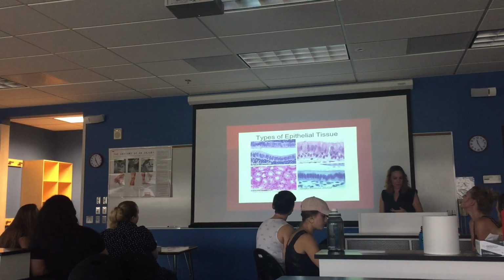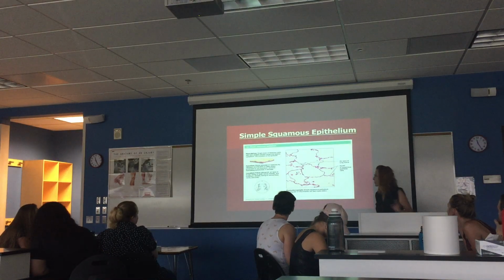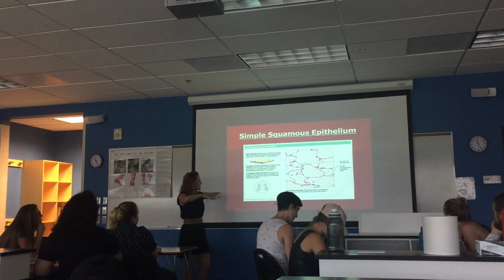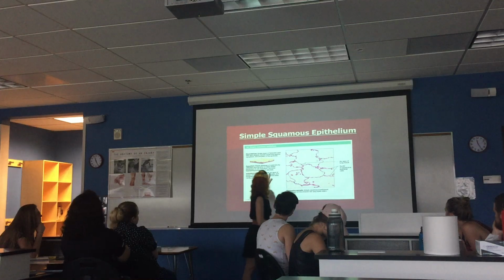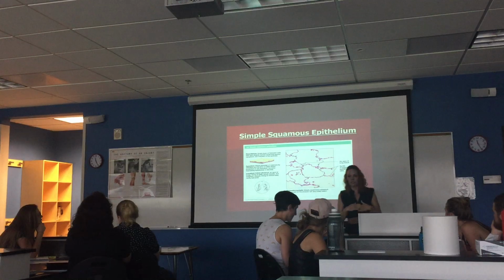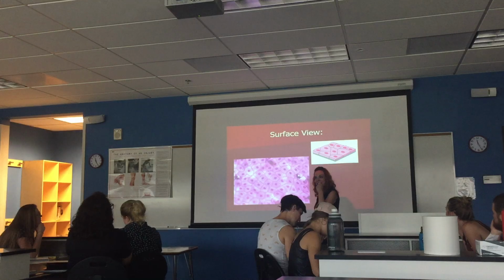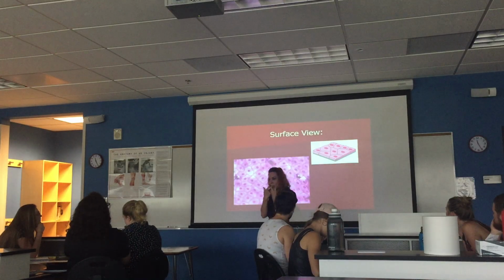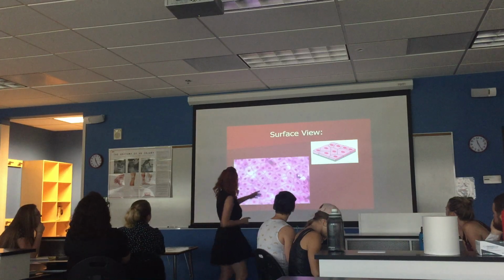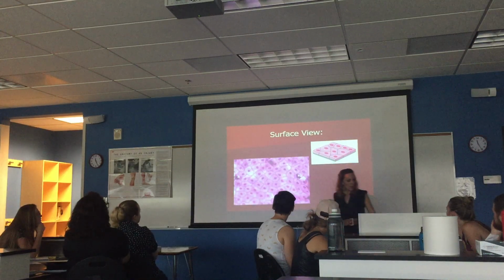All right, so different types of epithelial tissues. Simple columnar, simple cuboidal. So simple squamous epithelial tissue is one cell layer thick of squamous cells. These are found in the air sacs of the lungs, lining the blood vessels. In fact, capillaries are simple squamous epithelial tissue, just one layer. If you did cheek cells, like you told me, those are squamous. They're not simple, but they're squamous cells that you scraped off from your oral cavity and put on a slide, so they looked maybe a little bit like this, floating around, or like this.